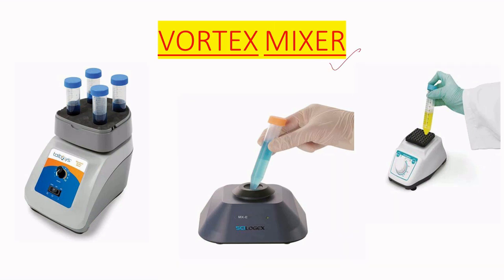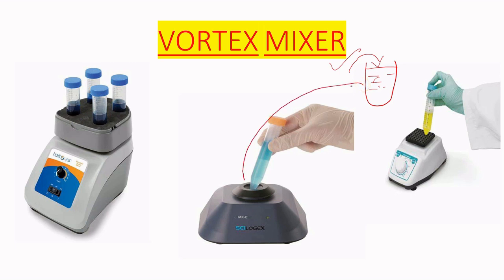A vortex mixer is used to mix components. Suppose we have prepared a media by adding distilled water with the readymade media — we then need to mix this media. To do so, we add the falcon tube or test tube into the vortex machine, which shakes the media to mix the whole total media.